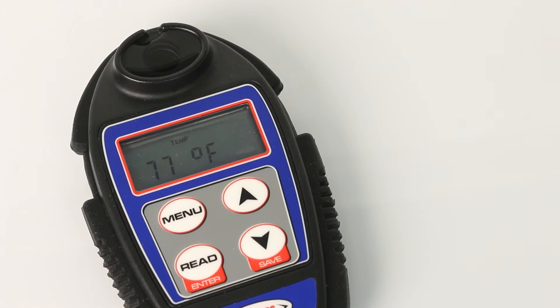Pressing the arrow up button displays the temperature of the sample. Pressing arrow up again returns to the conductivity reading. Power turns off automatically after 30 seconds of inactivity. Press Read Enter.